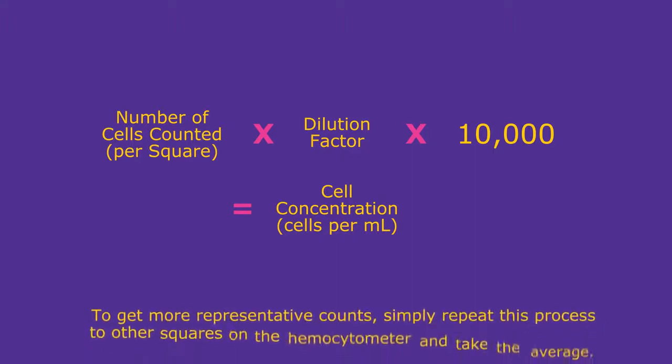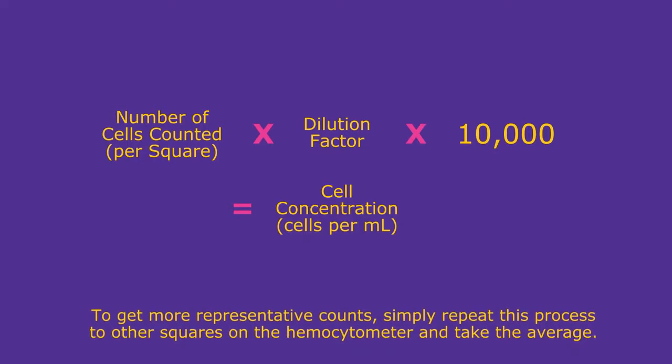To get more representative counts, simply repeat these processes to other squares on the hemocytometer and take the average.